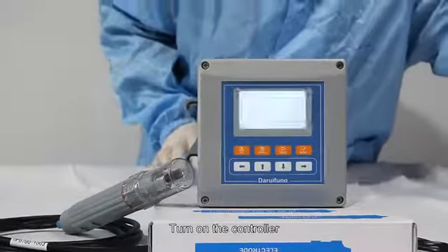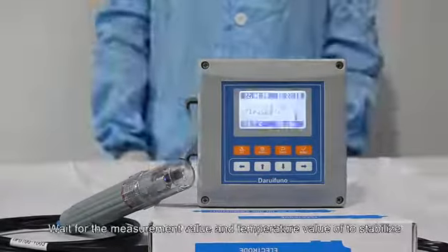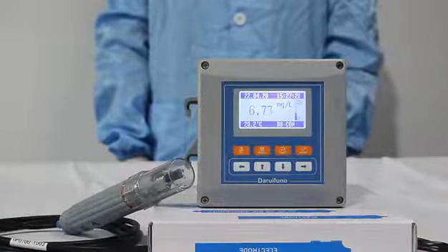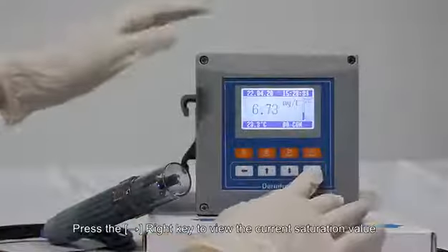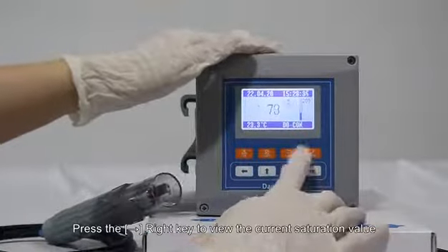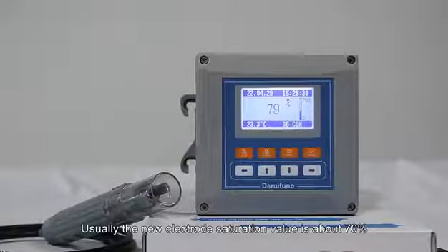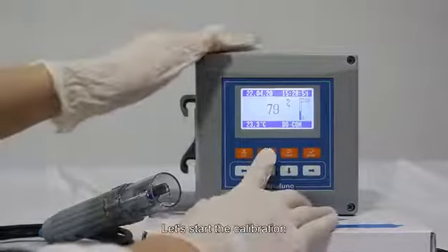Turn on the controller. Wait for the measurement value and temperature value to stabilize. Press the right key to view the current saturation value. Usually the new electrode saturation value is about 70%. Let's start the calibration.